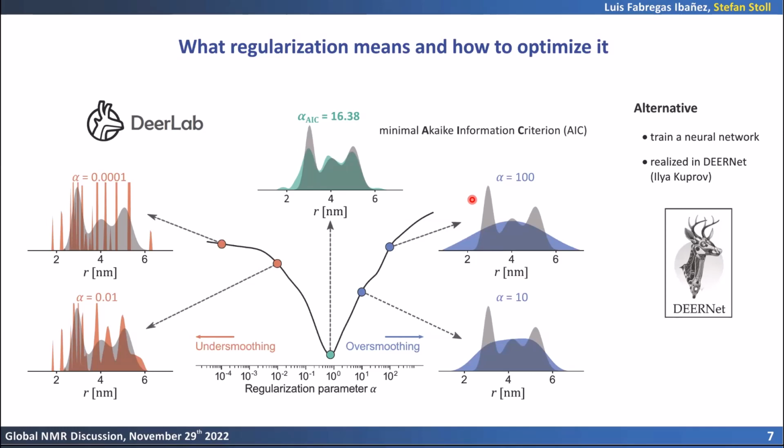You have to decide at which singular value you truncate, and that's a very unobvious manual decision. Yes, it has been tried. Madhur Srivastava and Jack Freed tried that. Yes, it's reasonably successful. And just as every other method, it does require you to be a bit of a specialist in what one is doing. And so it's really hard for an inexperienced person to pick these parameters.